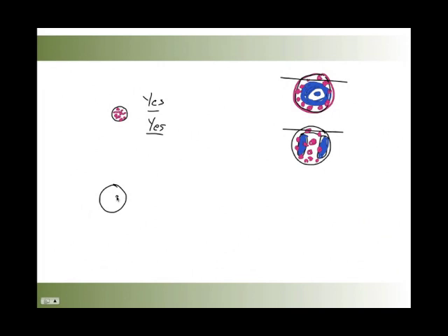And this was slightly bigger, if you'll recall. It had a nucleus here, centrally placed and round, and then it had granules. So the granules and the fact that it was in the connective tissue space told us unequivocally that this was a mast cell or an eosinophil. Okay. Now we have a round nucleus, and so could this be a mast cell? A mast cell has a round nucleus and granules. This has a round nucleus and granules. And so the answer to that would be yes.